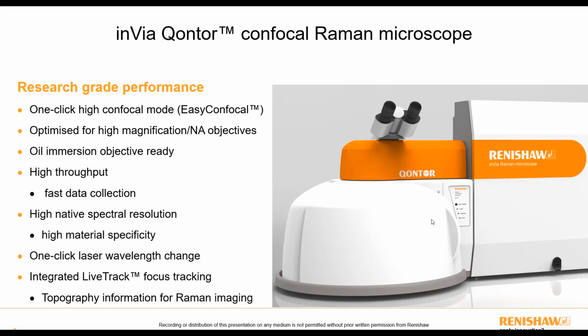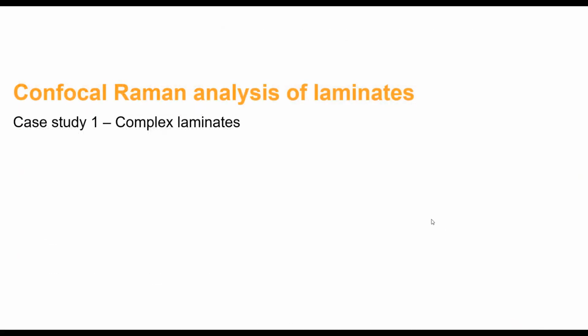And this system has live track focus tracking integrated into the system. That's not really relevant for the depth profiling work, but certainly as we get on to looking at sections, it can give us some really complementary information, both giving us high spatial resolution for the chemical information, but also allowing us to get topographical information from the surface of our material.